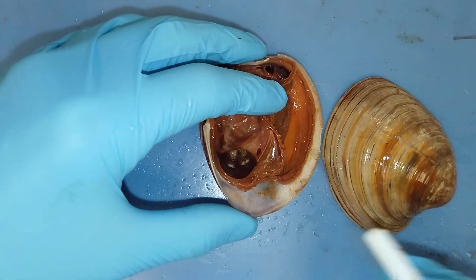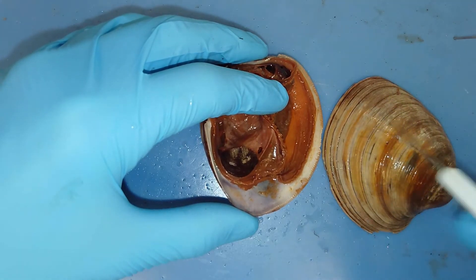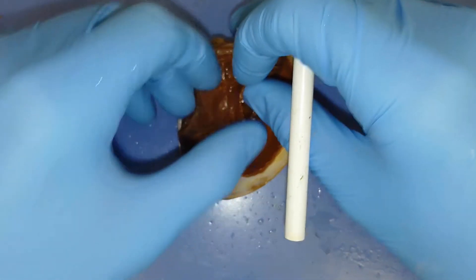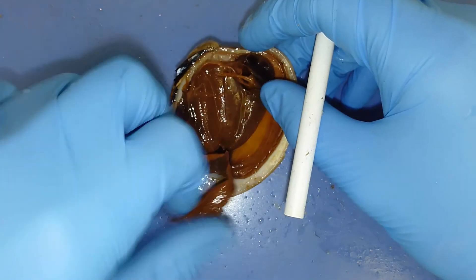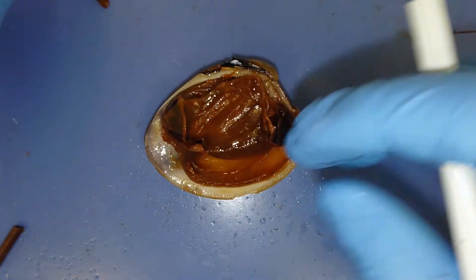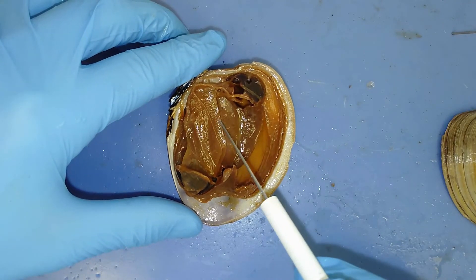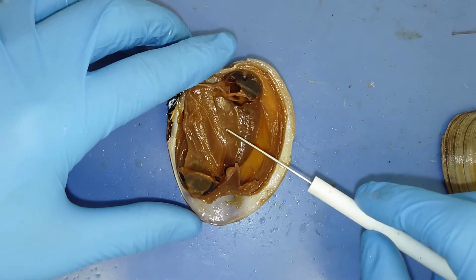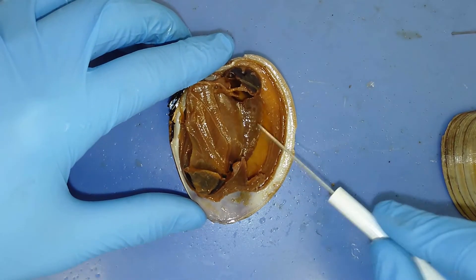This mantle is layering on calcium carbonate, and you can see that in all the growth rings in this shell. Moving the mantle out of the way, we can see the other three structures. You can see the gills right here. This structure here is the visceral mass — just a sac-like structure that holds all the internal organs. And then this really rough structure here is the foot of that individual.